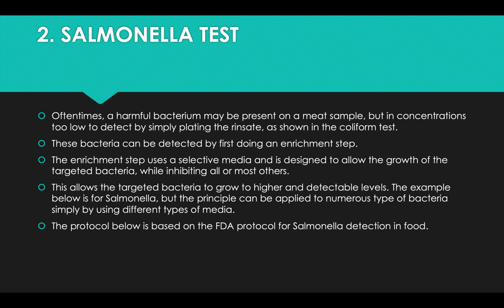In the case of Salmonella, the same principle can be applied to numerous types of bacteria simply by using different types of media.